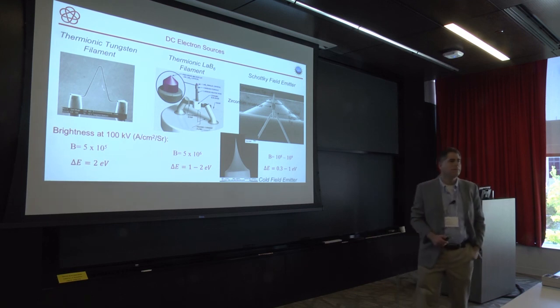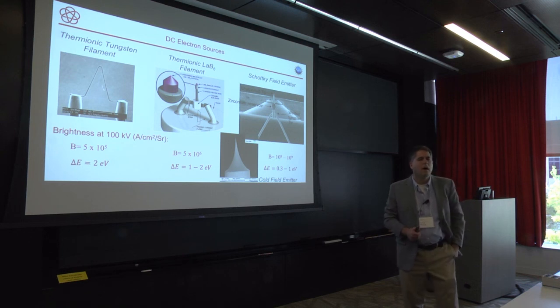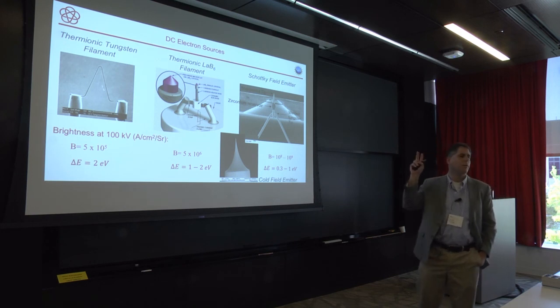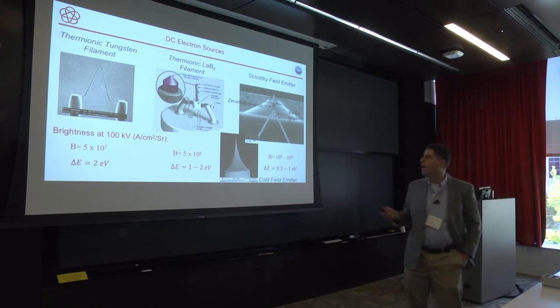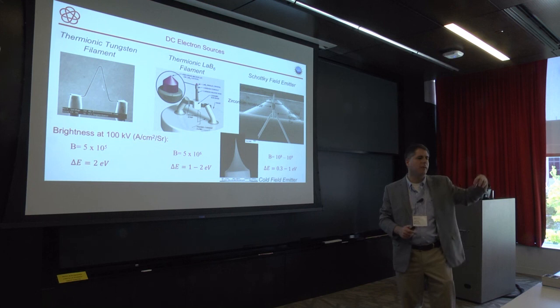So the term Boersch effect is very out of date for accelerator scientists. It probably comes from the 1930s. I think now, do you mean intrabeam scattering? Is that what you're referring to? There are two parts to this. There's the intrabeam scattering, and then there's just as it's being field emitted, right near the tip itself.